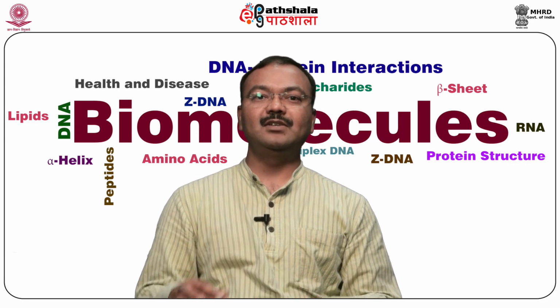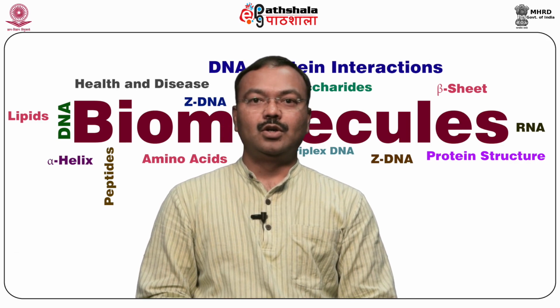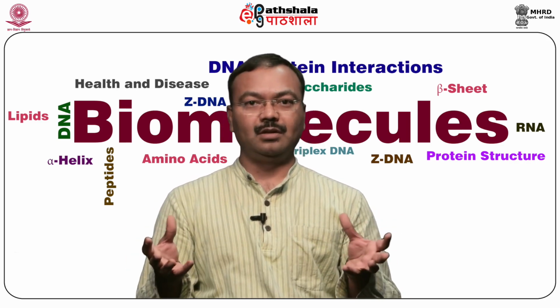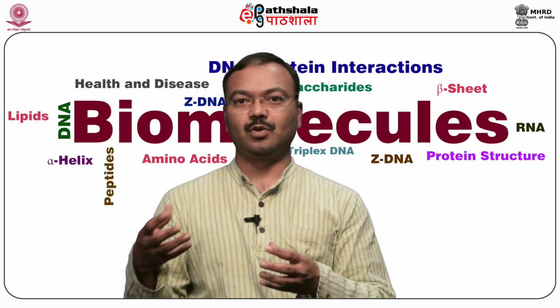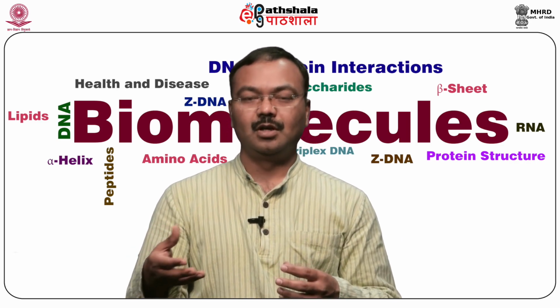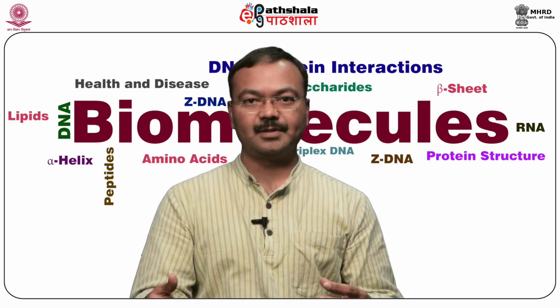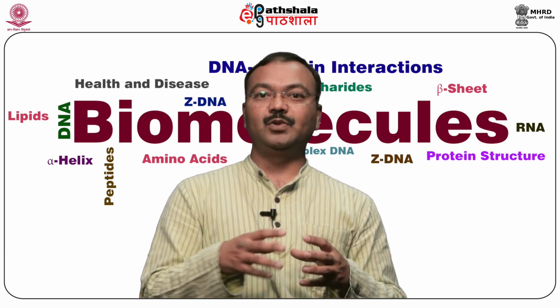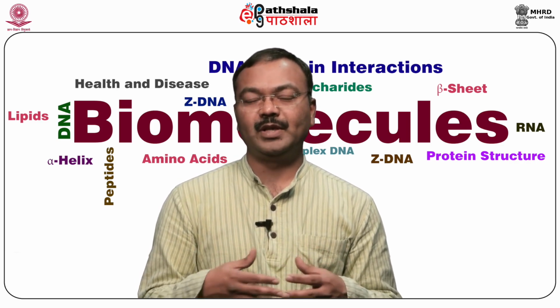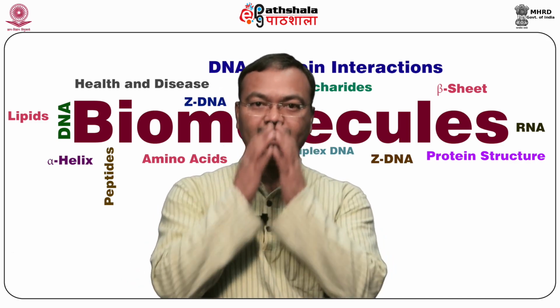So what are the requirements for an X-ray diffraction experiment? For protein structure determination, you need a large quantity of protein which needs to be crystallized. Crystallization only happens when you have a supersaturated solution. So if you want a supersaturated protein solution, you need to have large quantities. Now crystals need to diffract. You may have crystals which are pretty bad, so they may not diffract. If they don't give information, there is no use. So you need diffractable quality crystals.